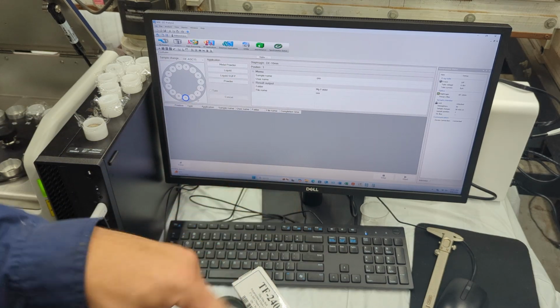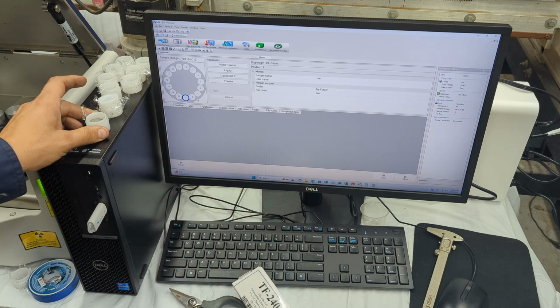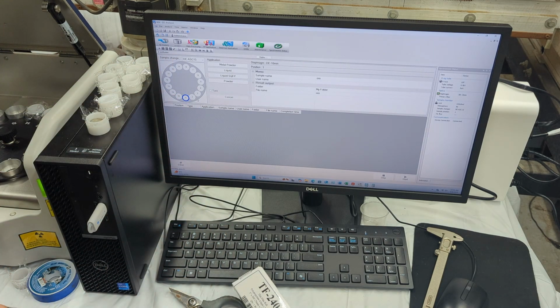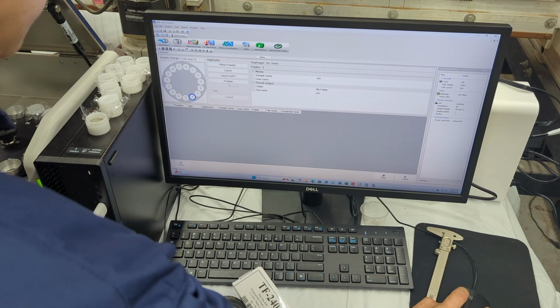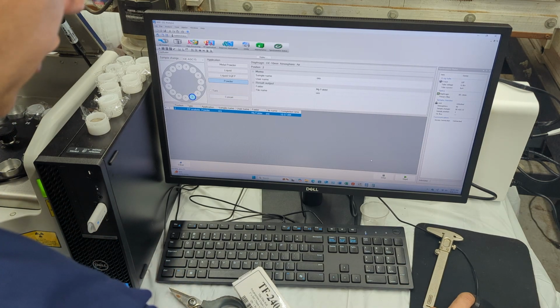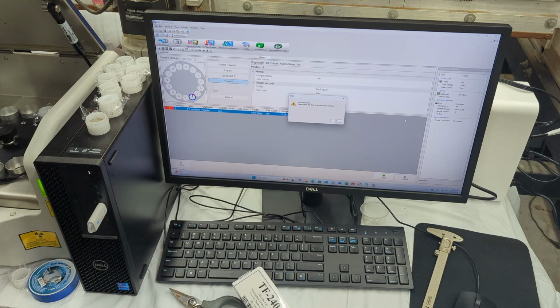And then, for example, on chamber number 2, I like to not put anything on chamber number 1, because when the machine is finished, that's where it resets to. And if you ever have this plastic break or whatever, it'll drop down on the sensor. So I just never keep anything on position number 1. So on position number 2, for example, we'll go here. We'll do powder, and then if we click on start here, it'll tell us to close the door.